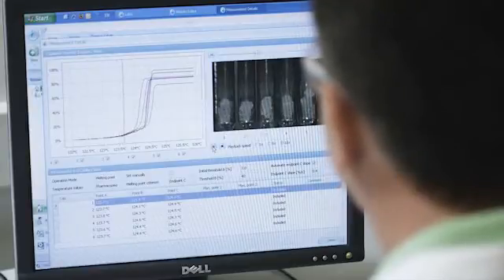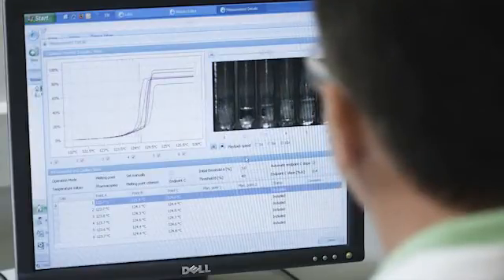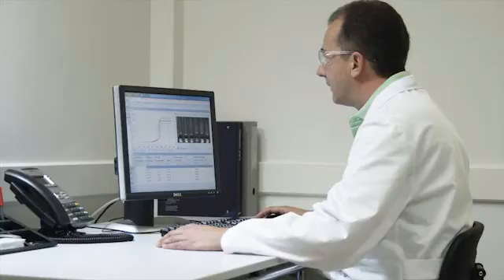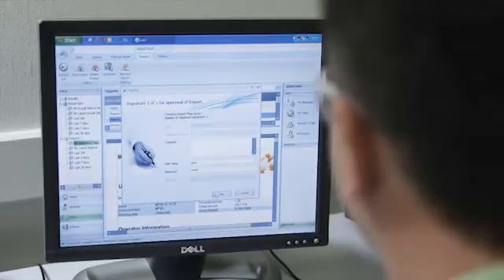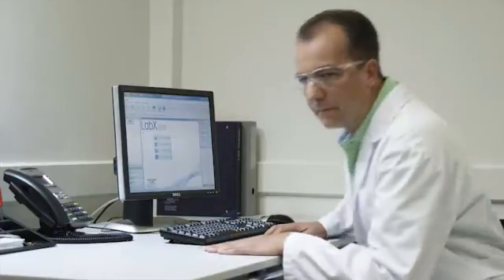Paul checks the calibration results and visual melting effects of the samples directly on the PC. He signs the report electronically and goes back to his remaining tasks.